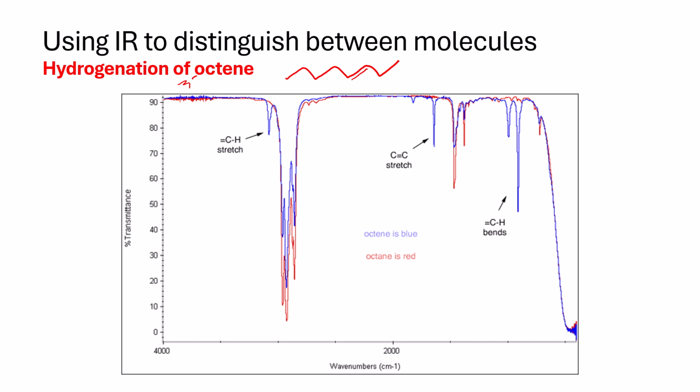What is important is that we're hydrogenating, which is that we're adding hydrogens across the double bond. So 1, 2, 3, 4, 5, 6, 7, 8. That's what we're getting. What is the change? Well, the main change is what we have here. The stretch, that is a carbon sp2 hydrogen, which is right above 3000. This is how we said before.